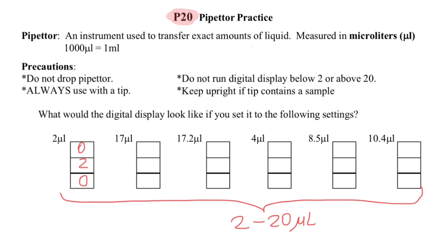Next, 17 microliters would be 1, 7 here and 0 here. It is not 170 microliters, it is 17.0 microliters. 17.2 microliters would be 17.2.